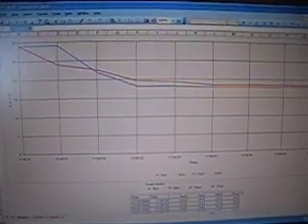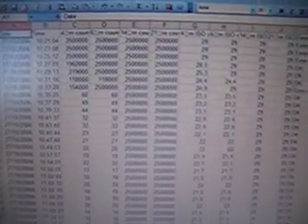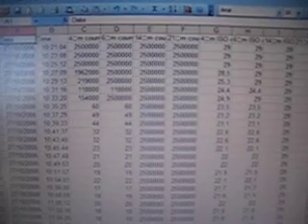If we look at an Excel spreadsheet, you can then monitor all the parameters this way, and effectively what we're looking for is the complete traceability back to that particular batch.